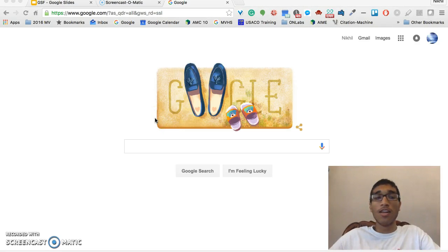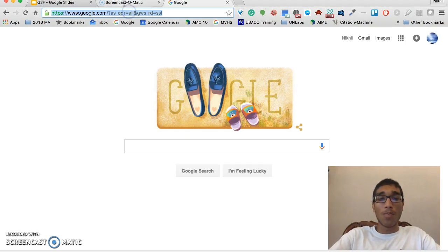This is Nikhil, and in this video, I'm going to take you through the process of using the web tool that I created for this project. So the first step isn't too hard. You just have to go to mirroranalyze.com.